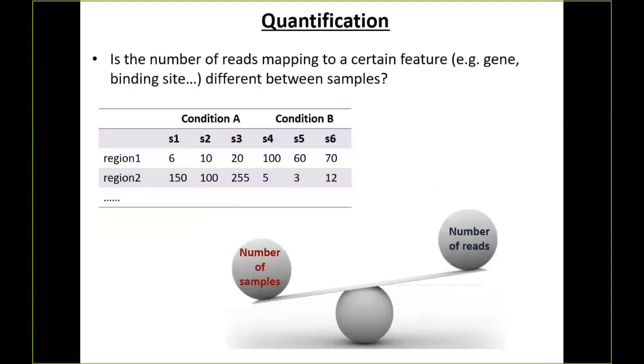All right, when you're doing quantification, things will change around a little bit. So another sequencing method I didn't bring up earlier, who here is thinking about doing ChIP-seq? Okay, one person, 2 people. That one used to be super popular and it's kind of fallen away. I know a lot of people now are doing ATAC-seq or things like that.